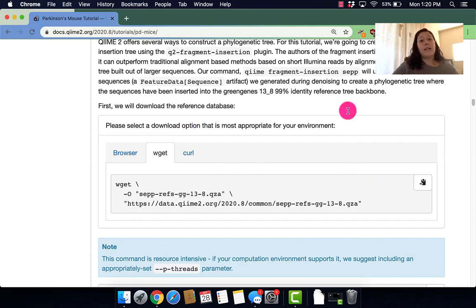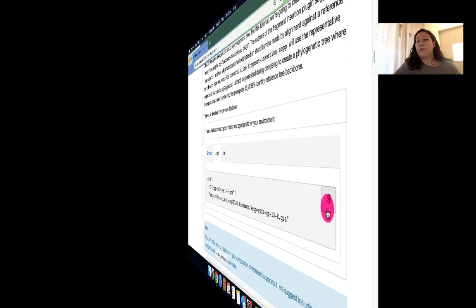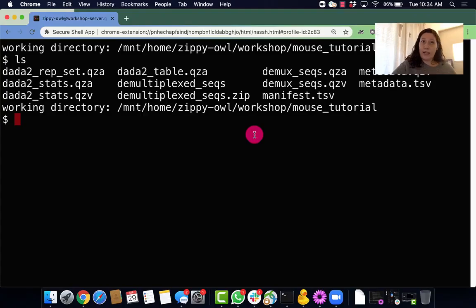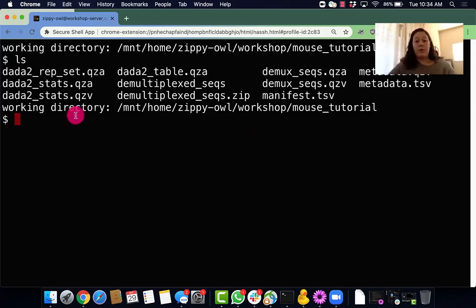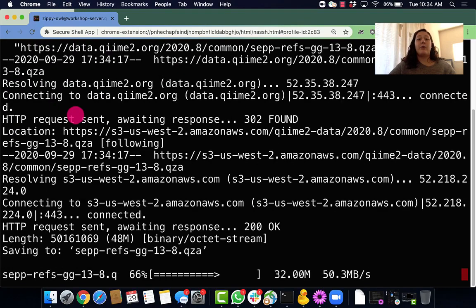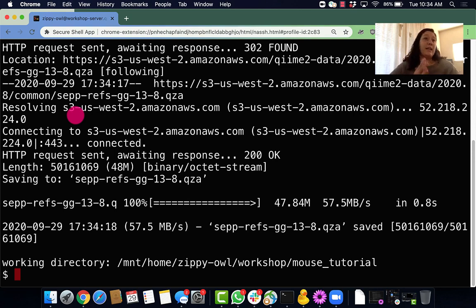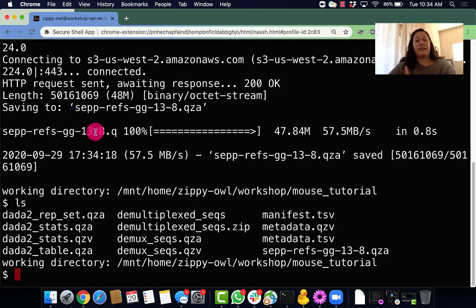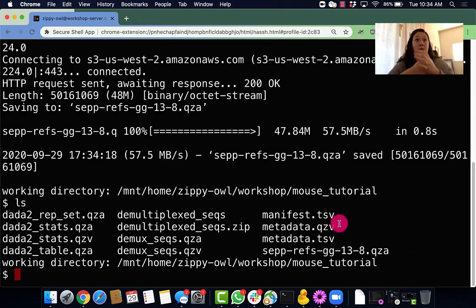So first we need to run wget. I'm going to copy from this little clipboard and head on over to my terminal where I'm going to paste in that command and run it. So now we've officially downloaded that from the internet, so let's make sure that we have it. As you can see, the sep ref file is there so we're good to go.